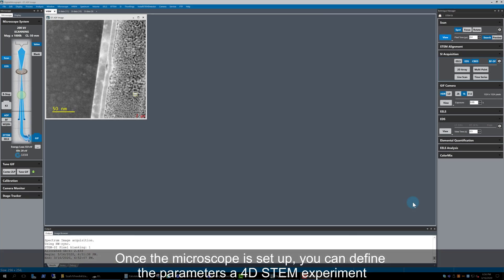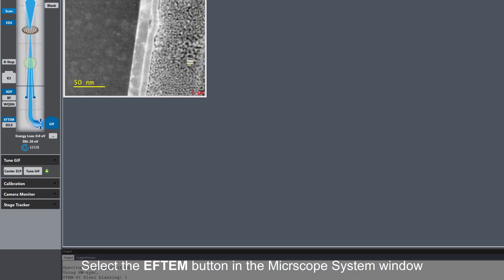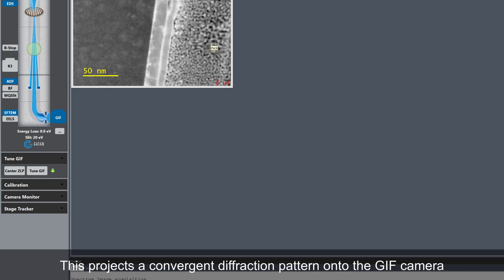As the microscope has already been set up for the EELS and EDS spectrum image acquisition, it is very straightforward to also acquire 4D STEM data. All that is required is to change the filter from EELS mode back to EFTEM by clicking on the EFTEM button in the microscope UI, and a convergent diffraction pattern is projected onto the GIF camera instead of an EELS spectrum.